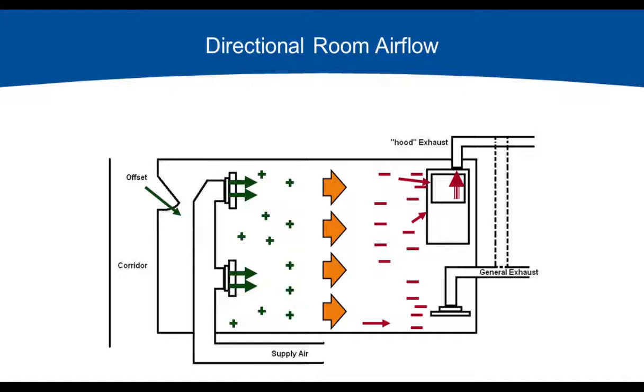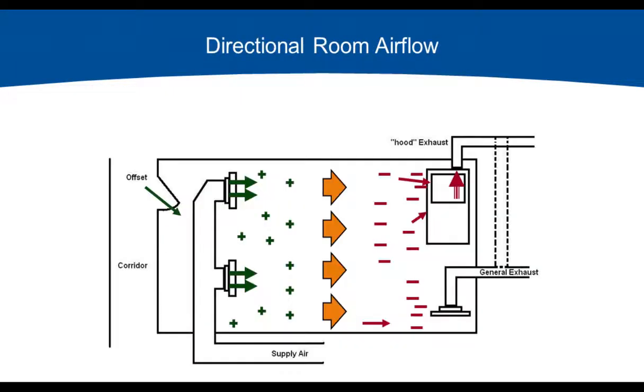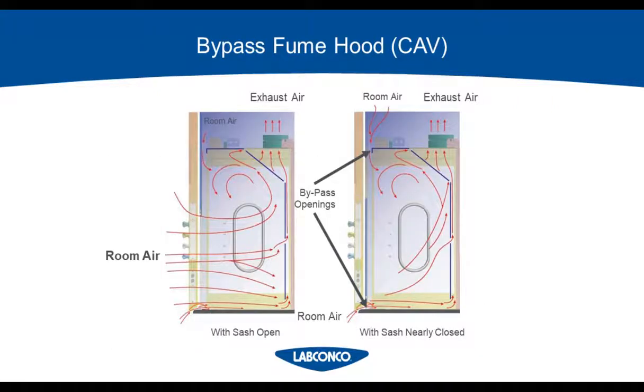So you've got a positive pressure system over there, and it's moving in a linear fashion from one part of the room towards the exhaust system. And as you can see, it's away from the corridor, away from the door. So it keeps the corridor safe for individuals who would be working there. Even if that supply air was overpowering the exhaust system in some type of circumstance where the exhaust wasn't working properly, you'd still be pushing the clean air towards where the contaminated air would be. So it's a safer design based on the way this lab is laid out.